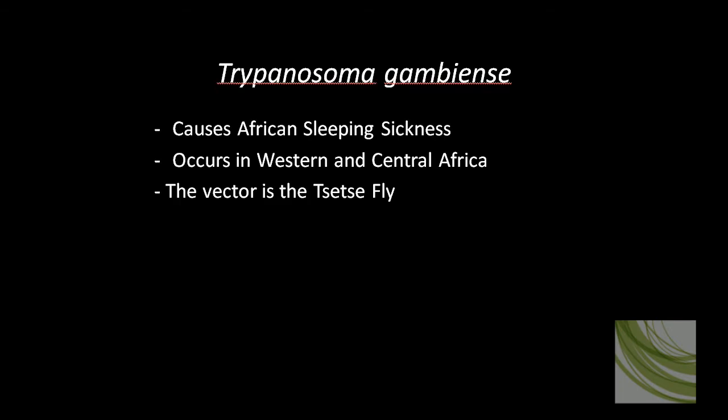Trypanosoma gambiense. This parasite causes African sleeping sickness. It occurs primarily in western and central Africa and the vector is the Tsetse fly.